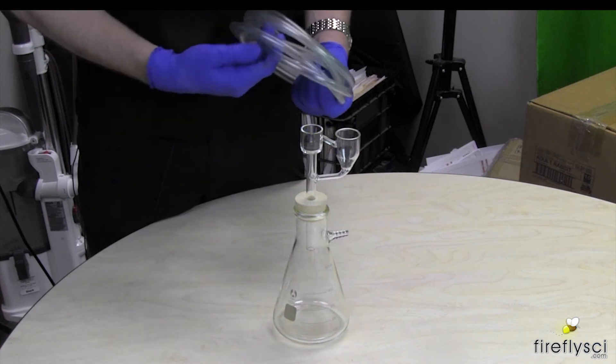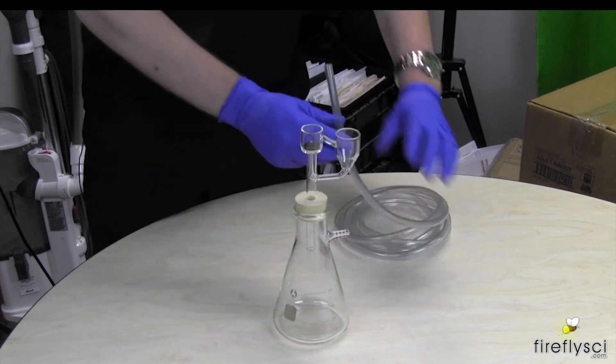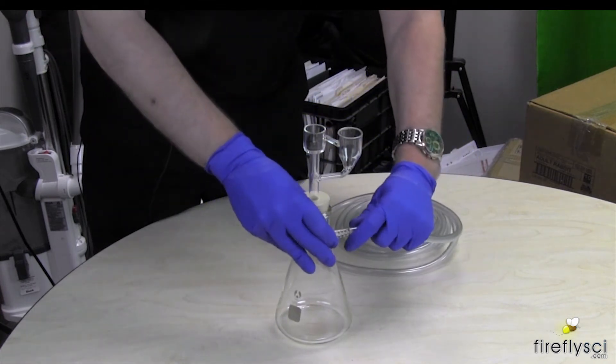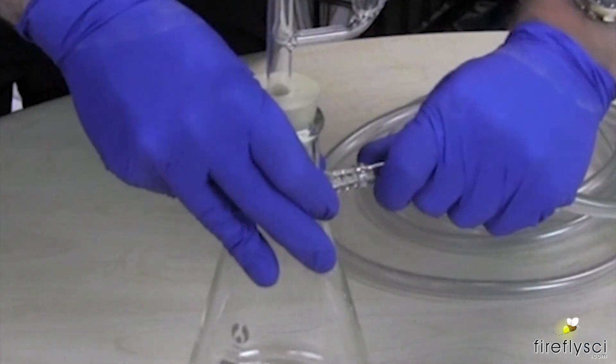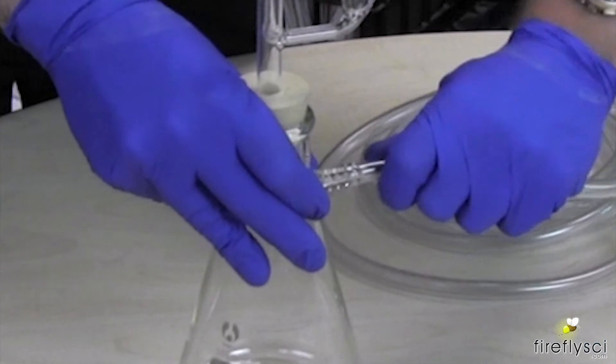In step number two, we're going to take our tubing and we're going to connect it first to the flask here just by gently pushing it on. You don't have to push it on all the way, just as long as it's tight enough to make a seal.